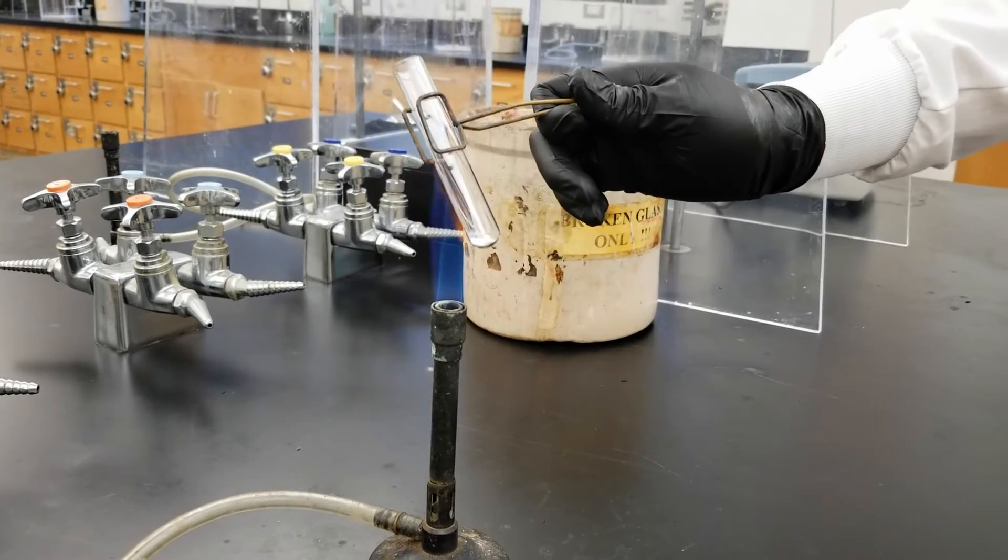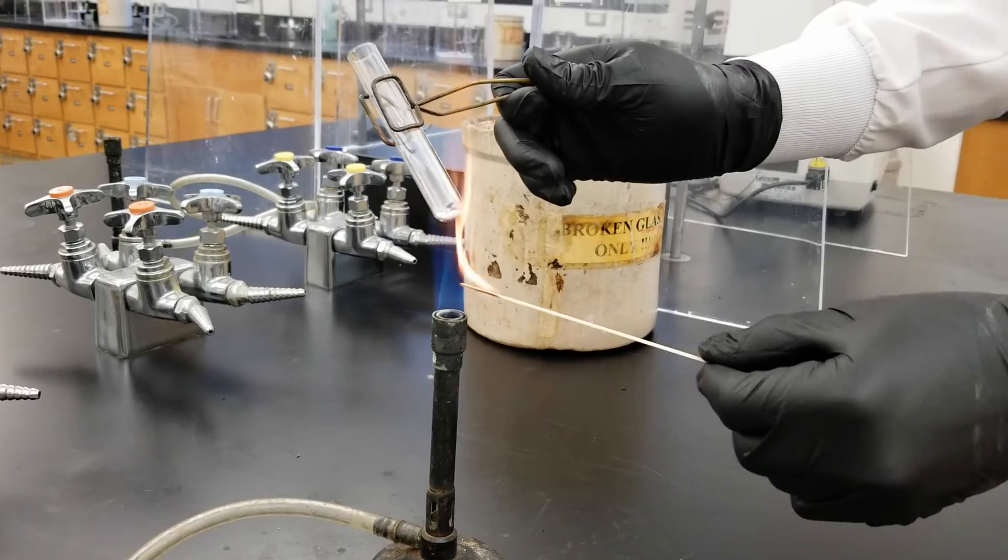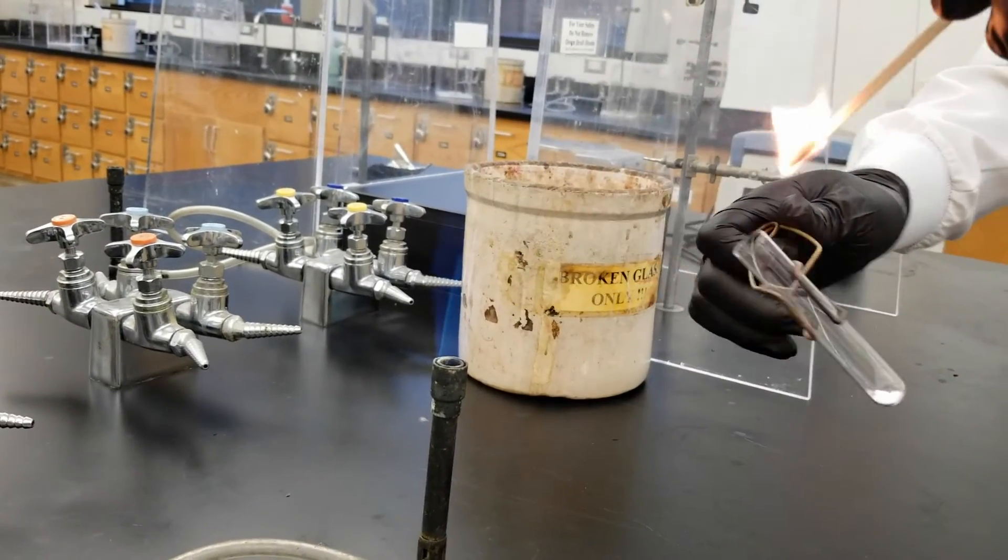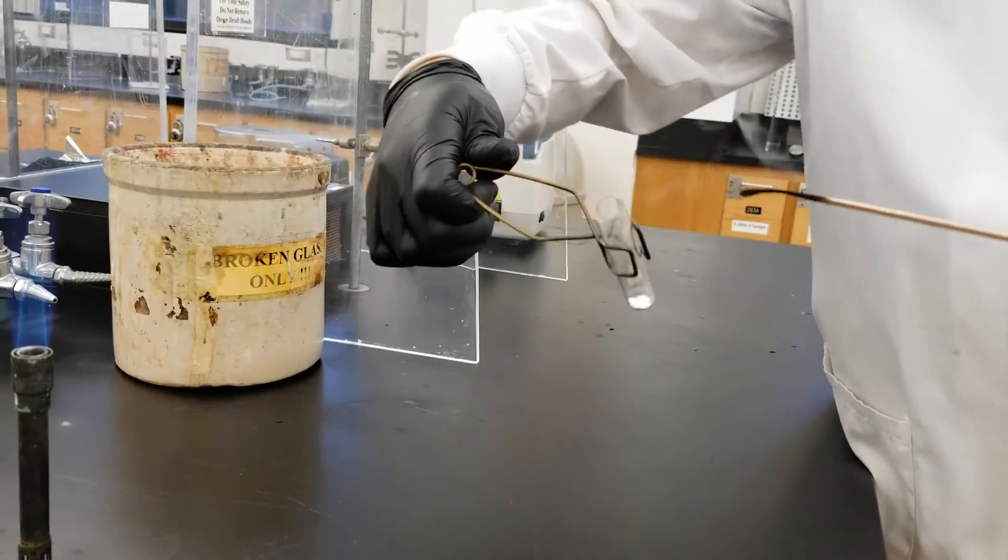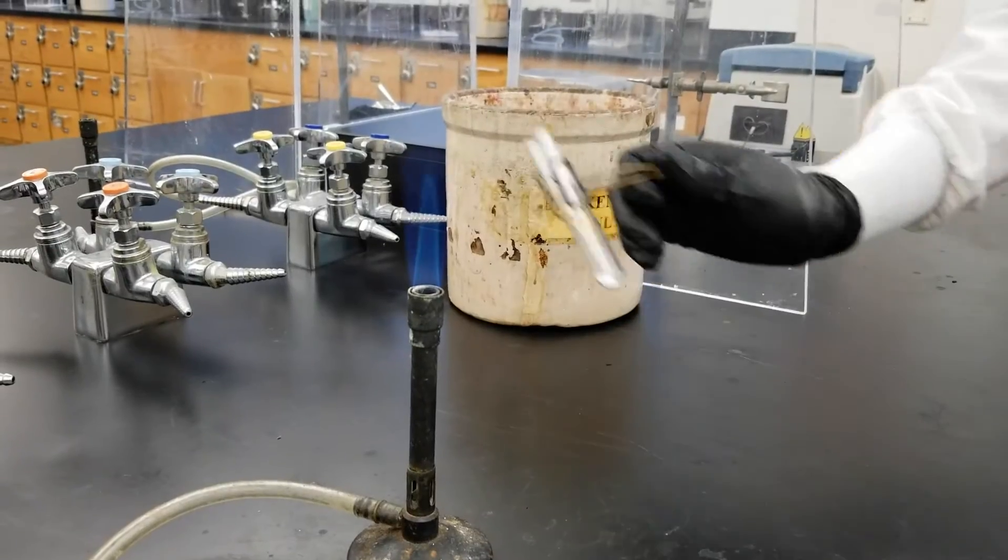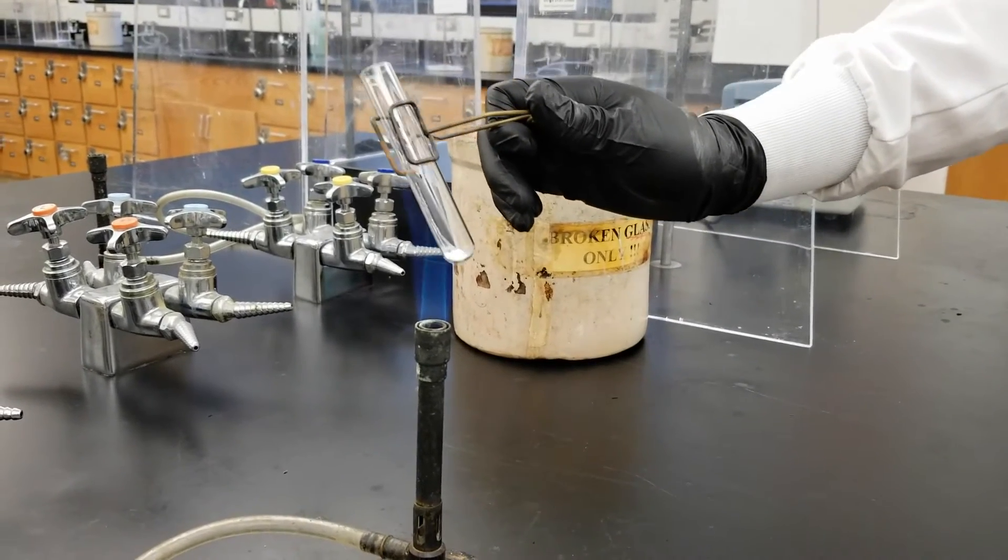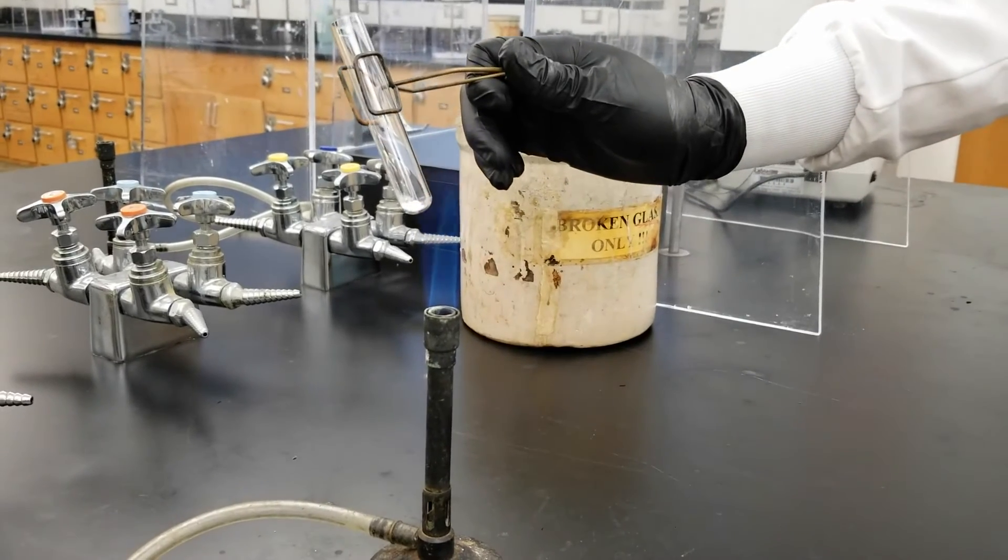Once you can see gas beginning to form you can use the same Bunsen burner to light a splint and perform a glowing splint test, and then you can heat the substance again to produce more gas and then perform a burning splint test. It's important to remember that if you have to do both of these tests you have to produce more of the gas in between because it may have been consumed when you did the test.